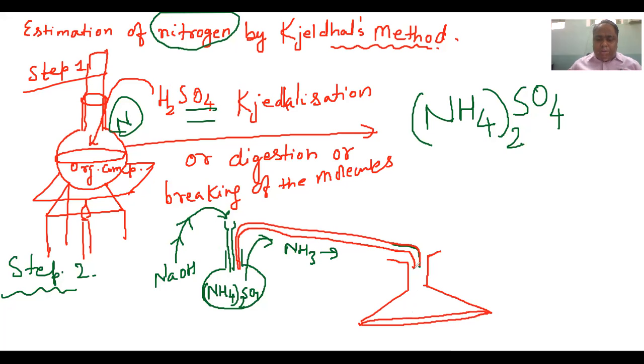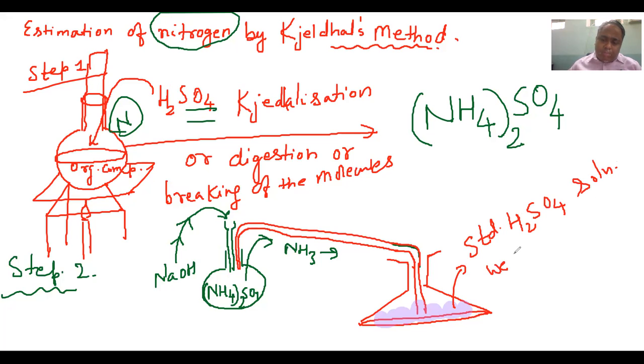Inside this we put standard H2SO4 solution, means we know its volume, we know its strength or concentration.